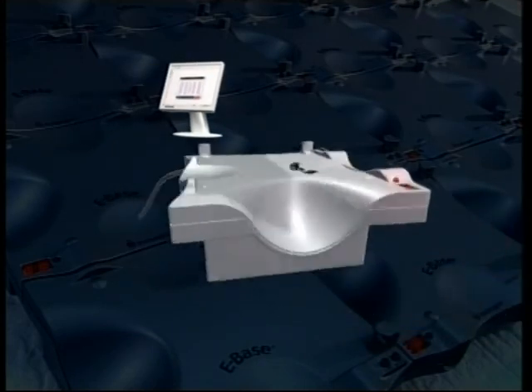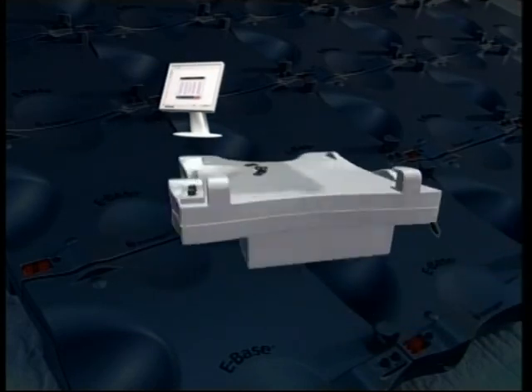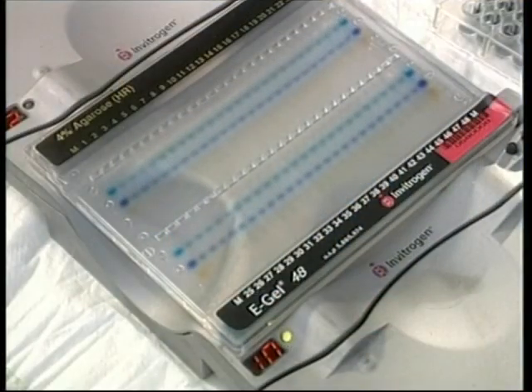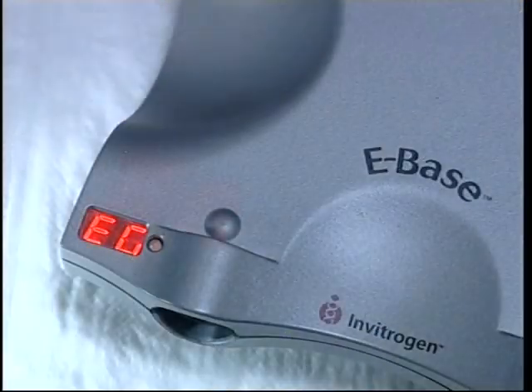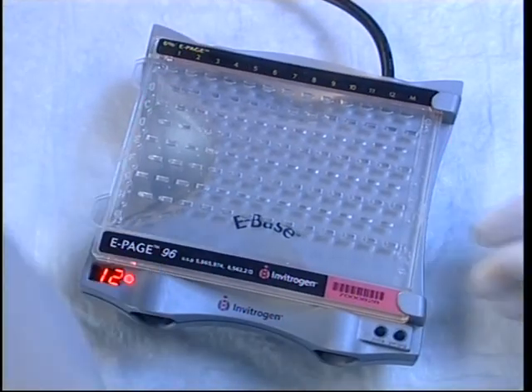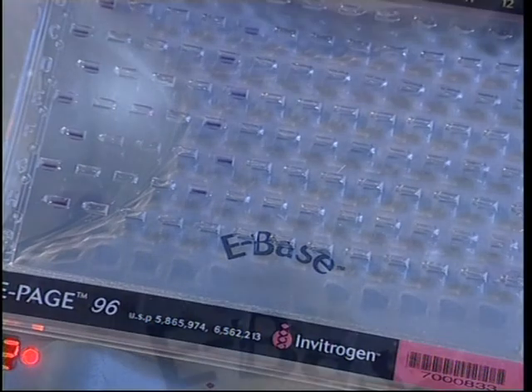With eBase, it is possible to use cassettes other than ePage, such as eGel 96 or 48. Just select the program you need and the right power profile is applied. You may change preset running times or control the run manually.